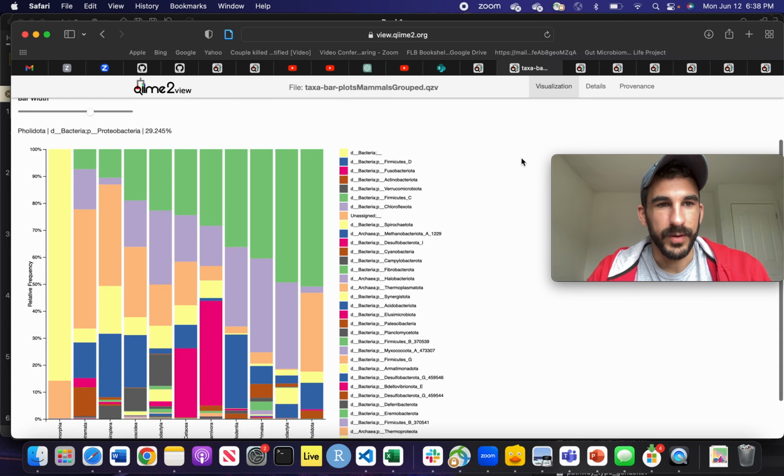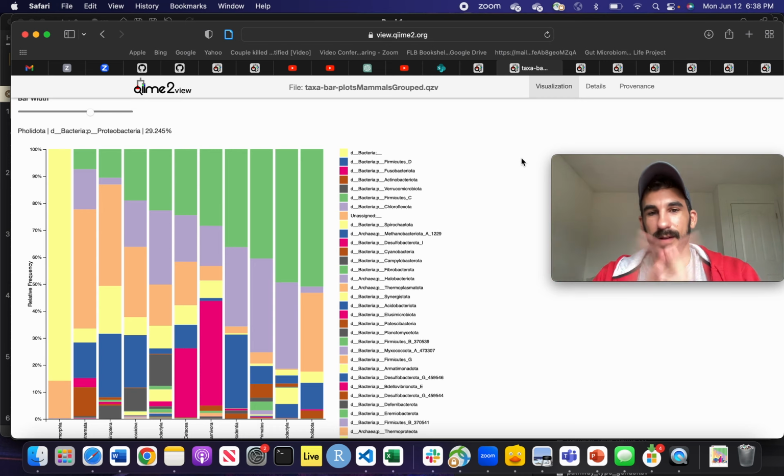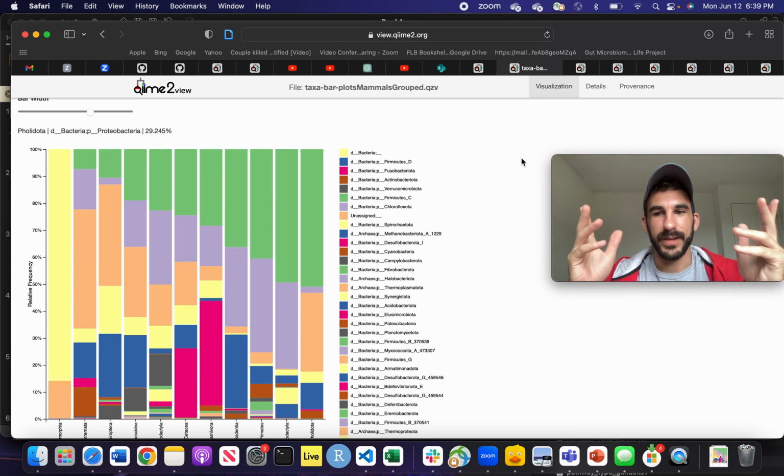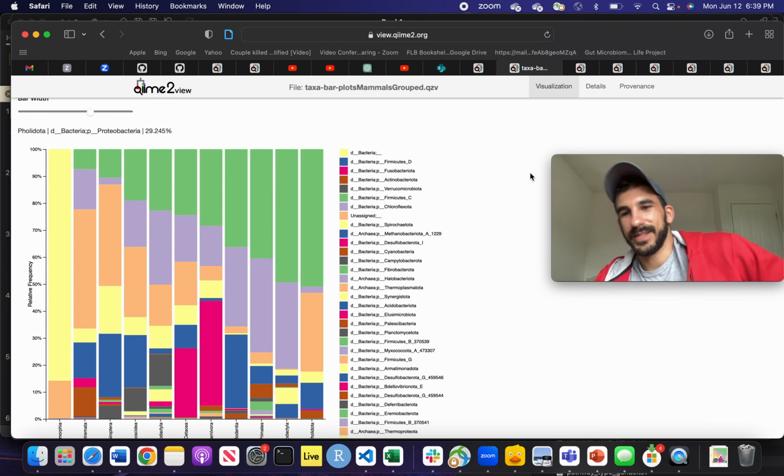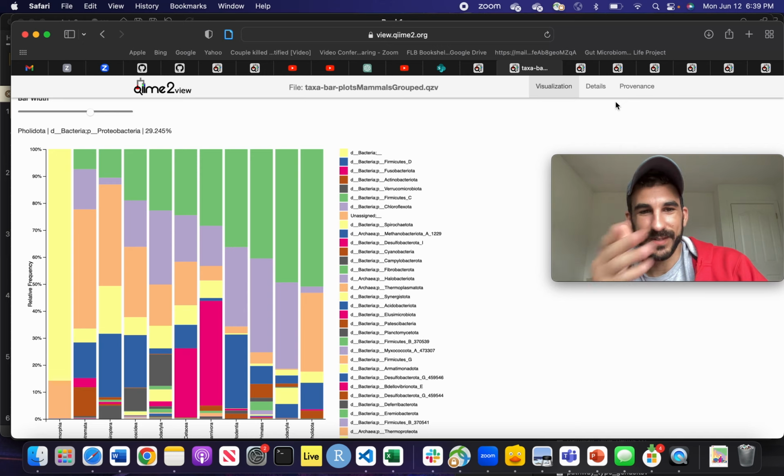But yeah, basically after this, you have 90% of the figures that you need for a publishable paper in a reputable journal. This is pretty amazing stuff. The one last figure might be a differential abundance analysis that can be sort of the icing on the cake. And that's something that I can help you with in the fall. I hope this was helpful, and sorry if it was kind of long and felt like I was working through it with you, because I was doing this for the first time and it's been a while.